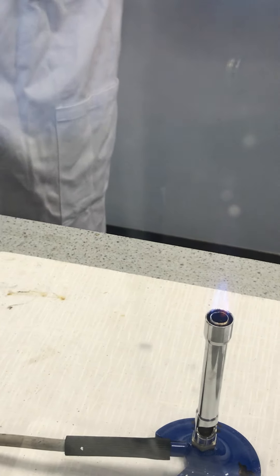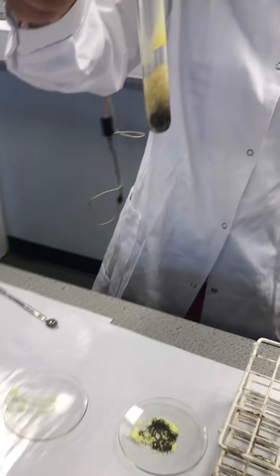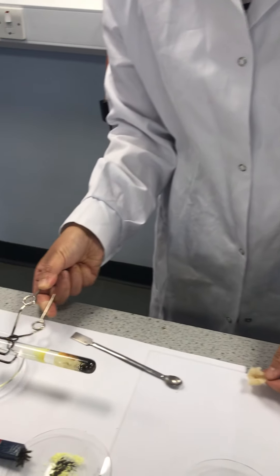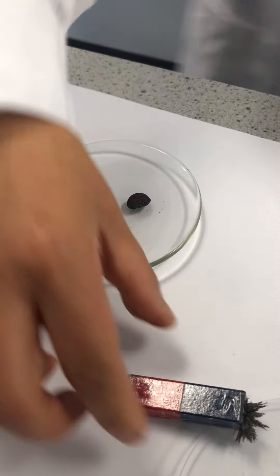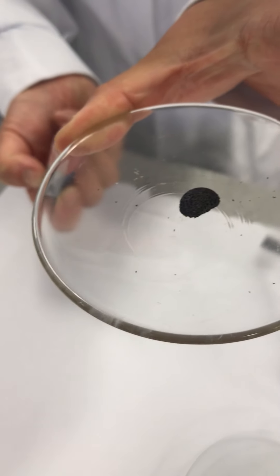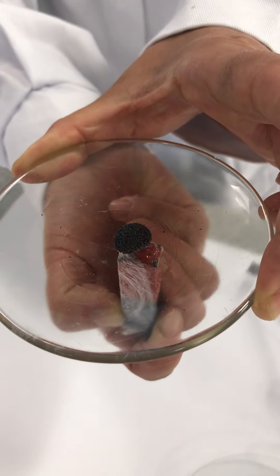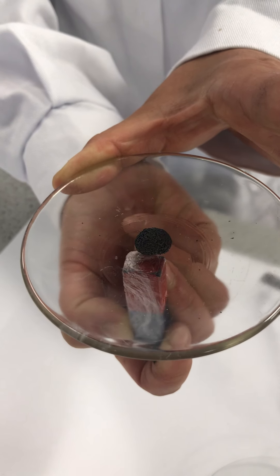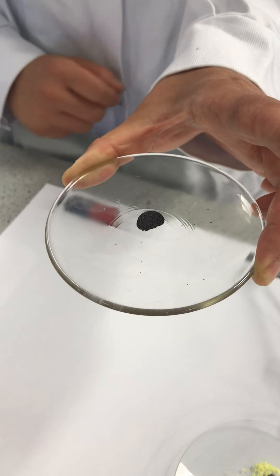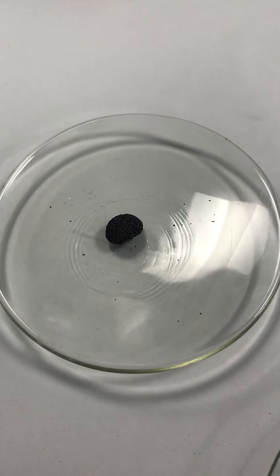Once heated, we will observe the appearance of this compound and perform the same magnet test as we did earlier. We can see the appearance of this compound made through heating the mixture of iron and sulfur. As we move the magnet underneath the watch glass, we can see we cannot separate the iron from the sulfur. By heating the mixture of iron and sulfur, the elements bond chemically to form a compound called iron(II) sulfide.